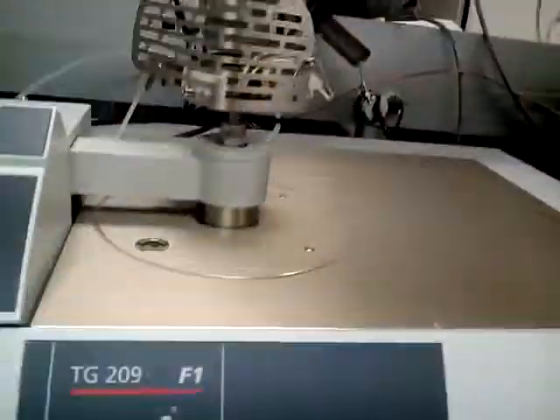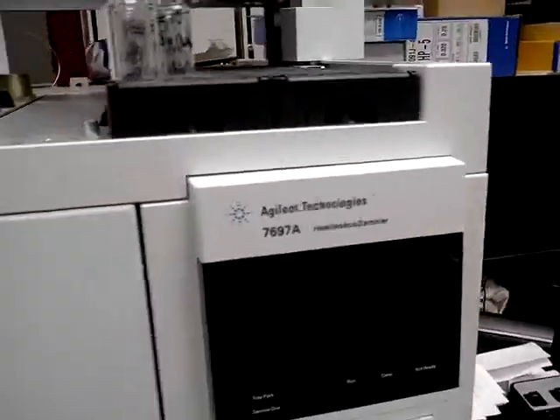Thermal analysis. TG-209. Yeah, Stockton. So, thermal gravimetric analysis. Oh, where are you going? GC. Another one. Okay, yeah. I see you, player. Headspace. Headspace GC mass spec. TGA.